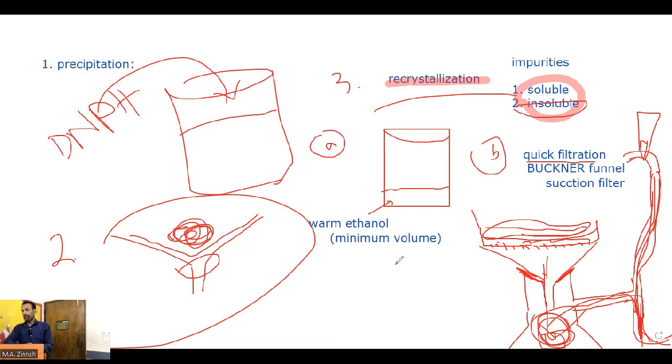Okay, so this is the process, and another part is still there, সেটা কি? This process so far just has removed insoluble impurity, but some soluble impurity may still be there. এই soluble impurity কি করবে? এই সলিউশনের সাথে চলে গেছে নিচে, ওকে? তখন আমরা জাস্ট করব এটাকে কুল ডাউন করব, leave for cooling. The solution was saturated and this was warm, so what would happen if you cool down the solution? কি হবে? হ্যাঁ, ক্রিস্টালাইজ করবে, ক্রিস্টাল হবে, আন্ডারস্ট্যান্ড?